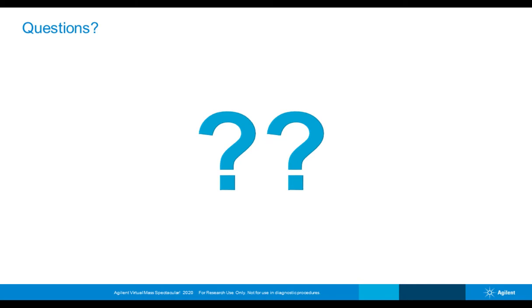Okay, great. And actually, it looks like we have time for at least one more. And I think this one goes to Dr. Sartain. Does analyte response still go down as the acquisition rate goes up on the newer 6546 Q-TOF? And doesn't that make really high acquisition rates impractical?